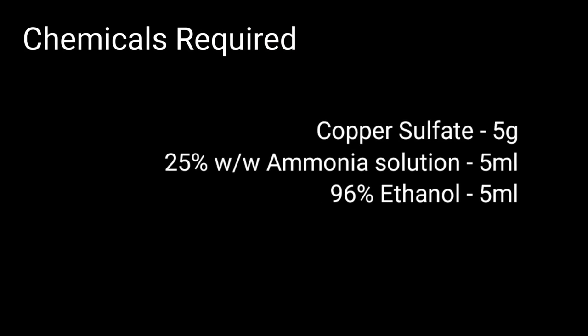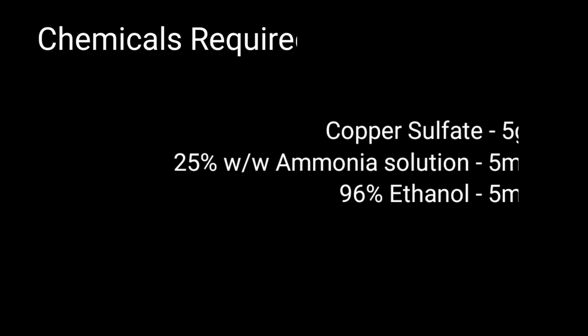For this preparation you will need 5 grams of copper 2 sulfate pentahydrate, 5 milliliters of 25% weight by weight ammonia solution, and 96% ethyl alcohol.